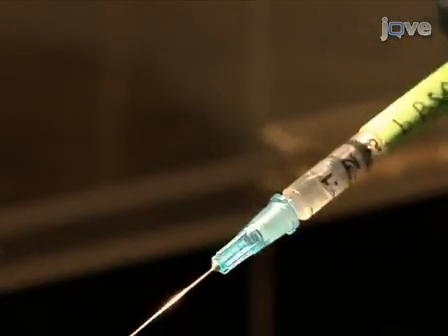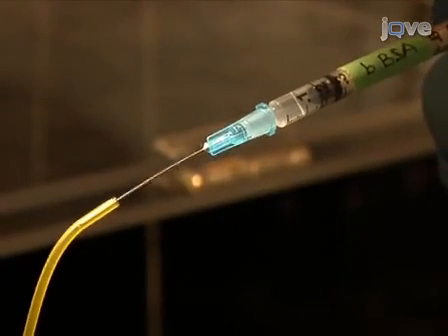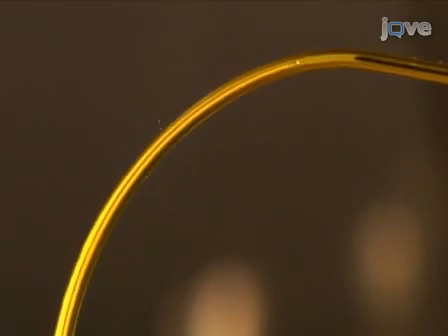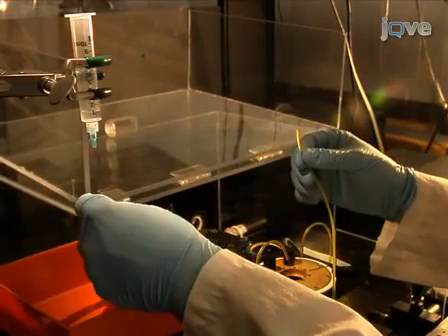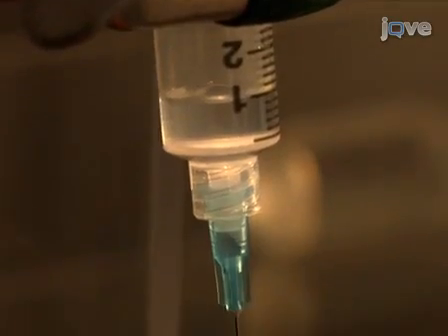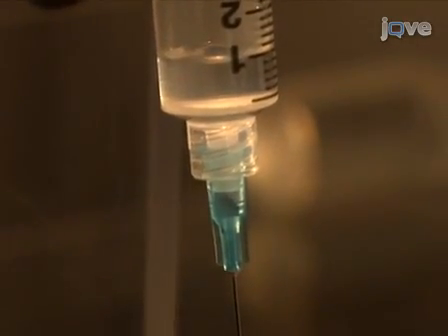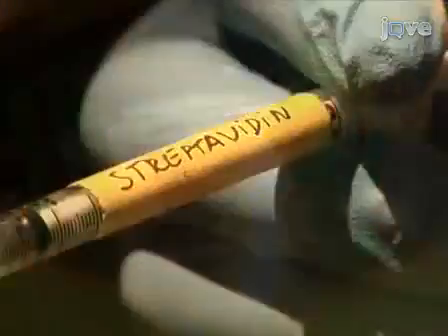Now inject a solution of 0.1 mg per milliliter biotinylated BSA in buffer A into the channel and incubate for at least 30 minutes. After the 30-minute incubation, flow 300 to 500 microliters of buffer A to remove any unadsorbed biotinylated BSA from the channel. Be careful not to trap any air bubbles in the chamber.